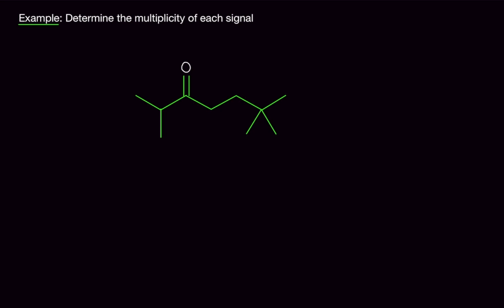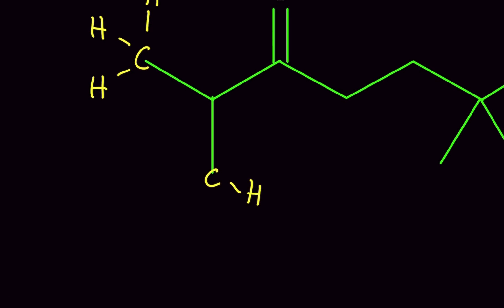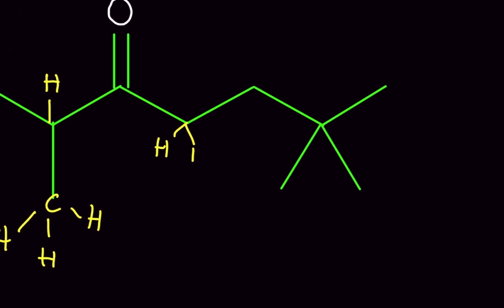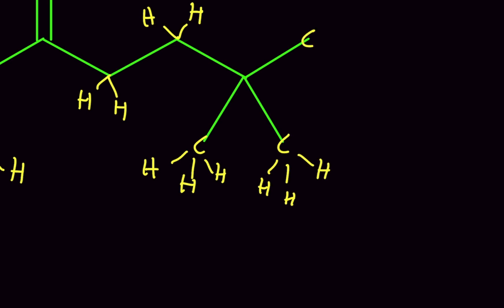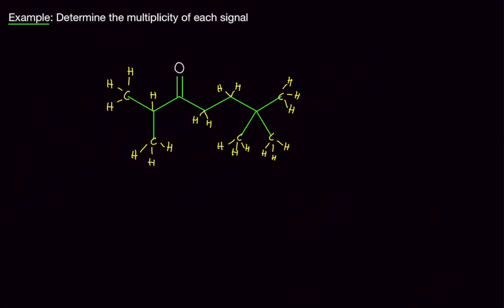The first thing you do is draw out the carbons and hydrogens. Okay, that's all of them.